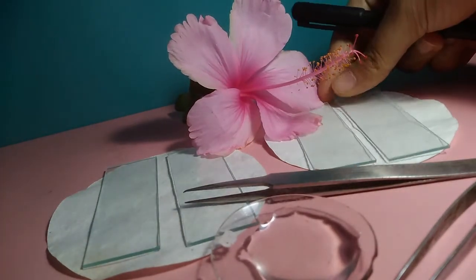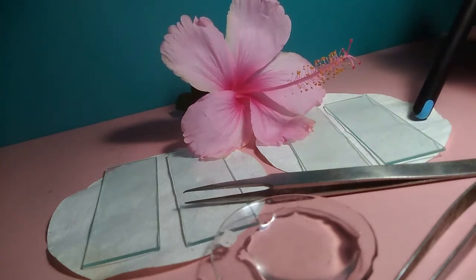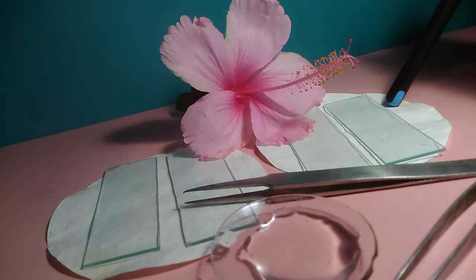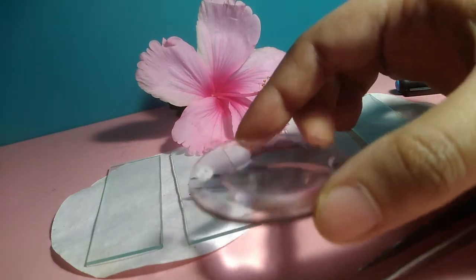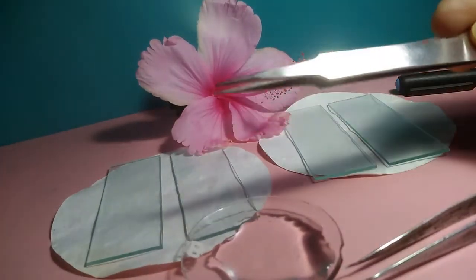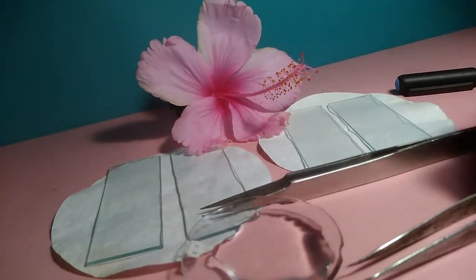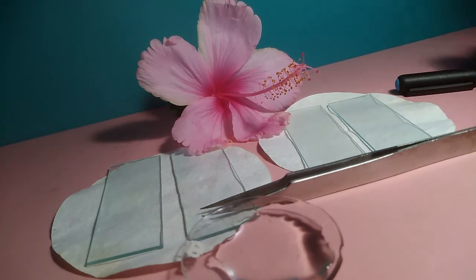If you don't have them, it's absolutely fine. And I have placed the slides on these filter papers. If you don't have filter papers, you can use simple plain papers as well. And then we have a watch glass, and in the watch glass I have taken some water. Then we have a forceps with a pointed tip, and I am going to use another forceps also, but one is absolutely sufficient. So now let us just start.